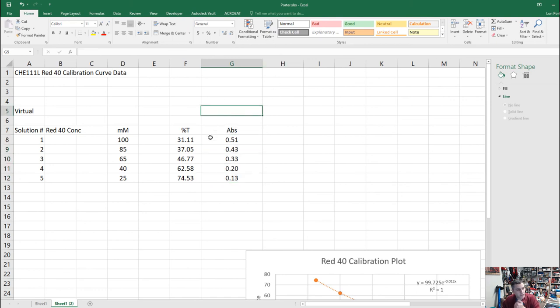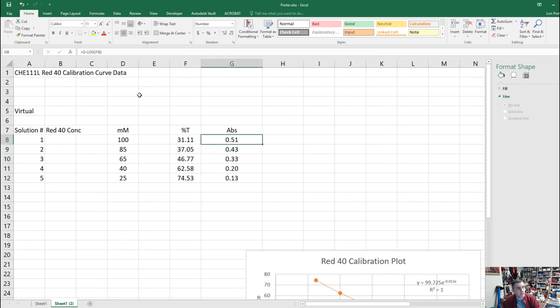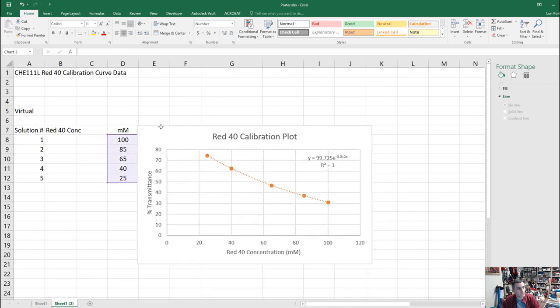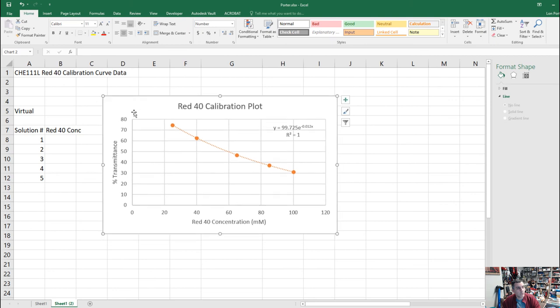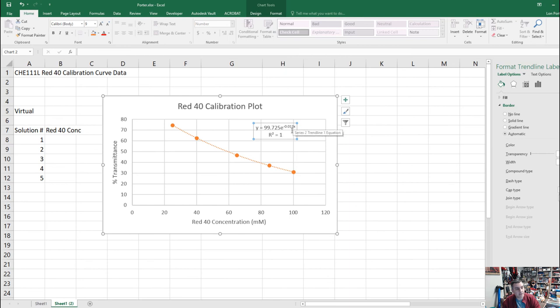In my Excel document I have the millimolar values and solution numbers one through five: 100, 85, 65, 40, and 25. The simulation gives you four significant figures. Enter your percent T values, then write a formula using absorbance = 2 minus log base 10 of percent T to calculate absorbance for each concentration. The first plot to generate is percent transmittance versus concentration — this will show the exponential shape, and you can fit it with an exponential trend line to confirm it's not linear.